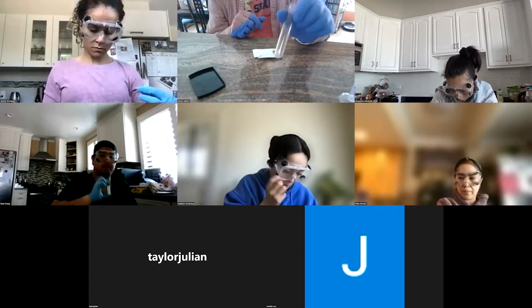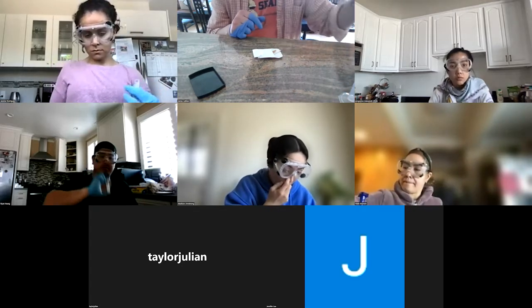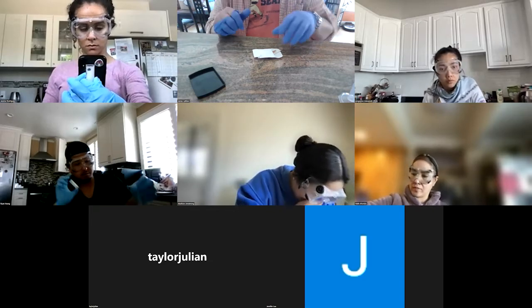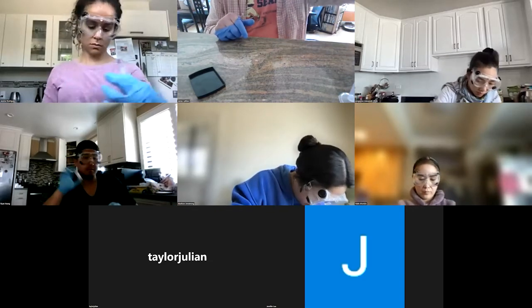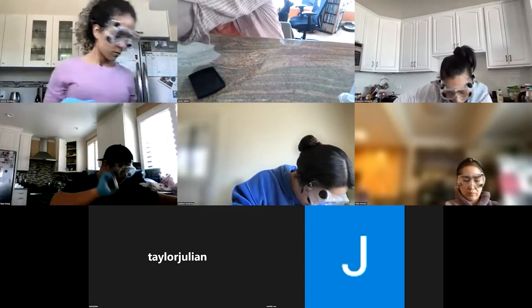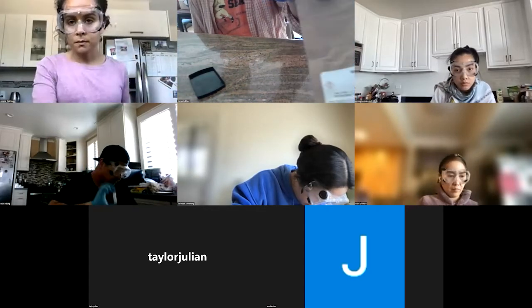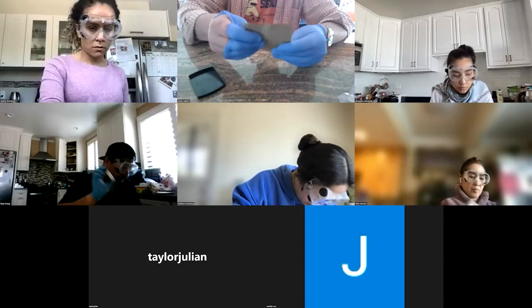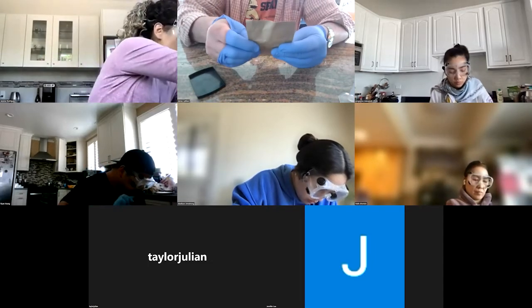So with the second tube, I'm going to try the hard water. This will be tricky because you can see it's got dog tooth marks in it, so I really don't know how much I have in here.